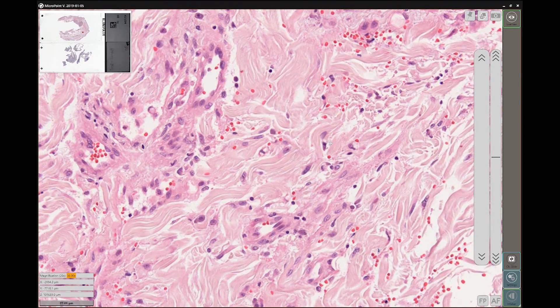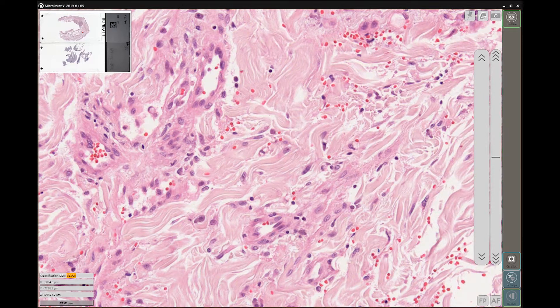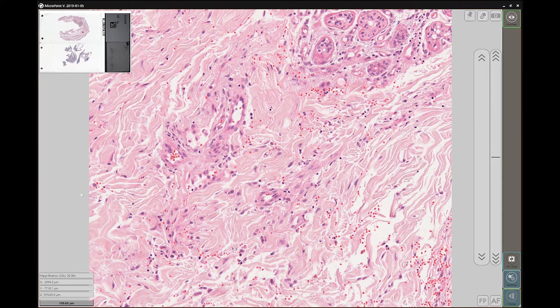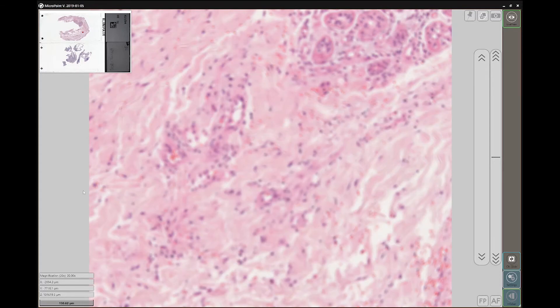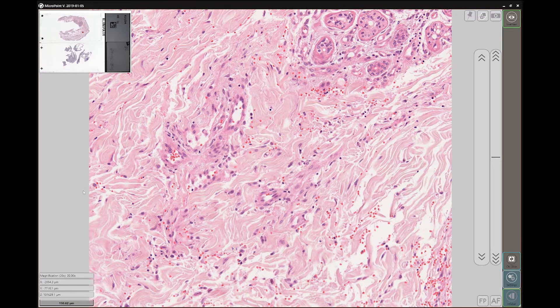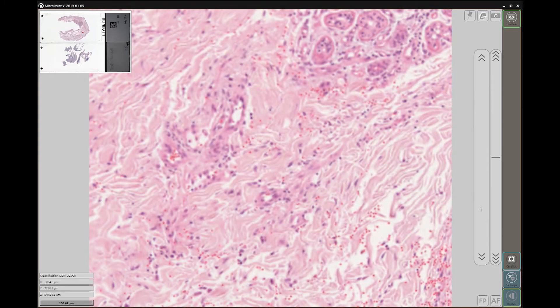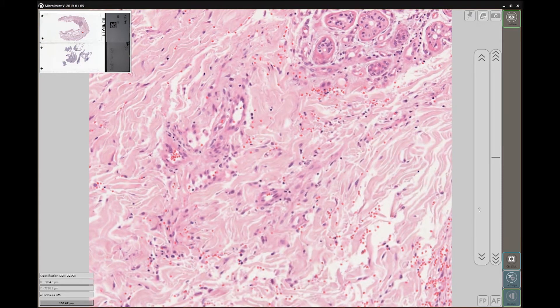But zooming doesn't mean that it will focus. As you can see, our sample is quite blurry at the moment. Let's see how the manual focus works. We can focus by clicking the left mouse button — hold it until you see a clear image and release. Another way is to use the z-axis control elements on the right: the fine drive and the coarse drive. The fine drive is slower and mainly used when you are close to the sample. Just left click and drag up or down the z-axis until you see a clear image.